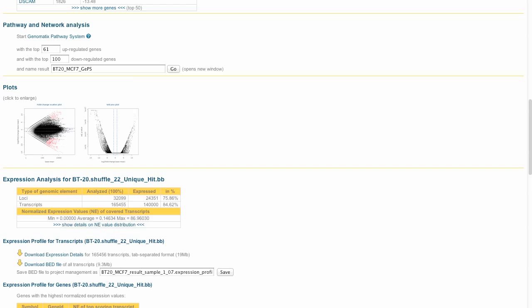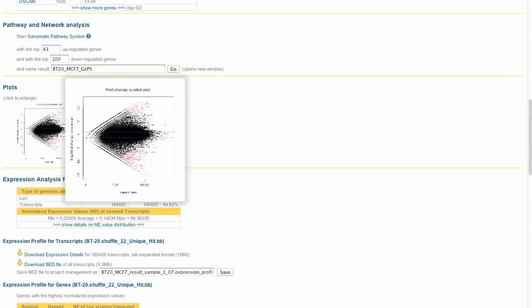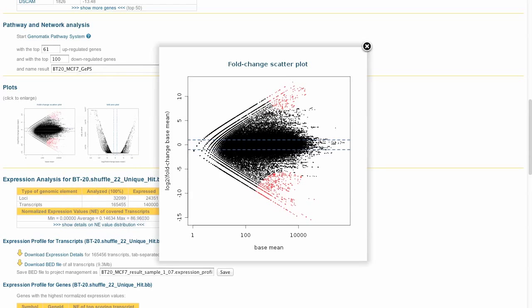The last thing I wanted to show you is what type of downstream analysis can be done with RNA sequencing data. For example, differential expression analysis can be done with DESeq, and here you can see a plot of the genes, their fold change, and their base mean.